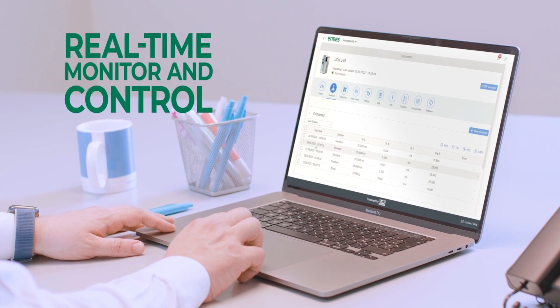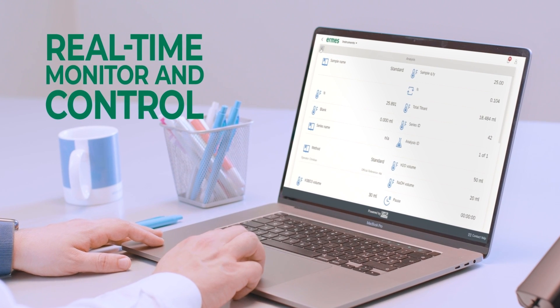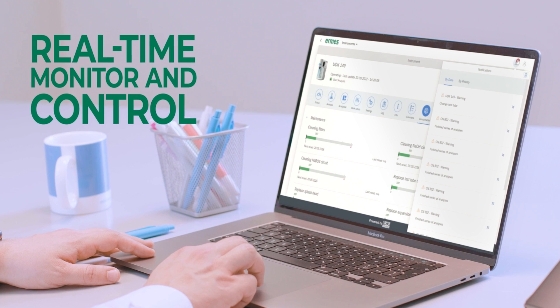Access from a PC, smartphone or tablet to manage multiple instruments, analysis data and instrument working conditions, receiving immediate event and alarm notifications.